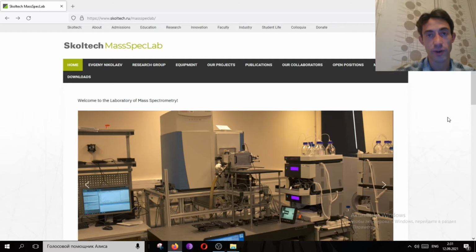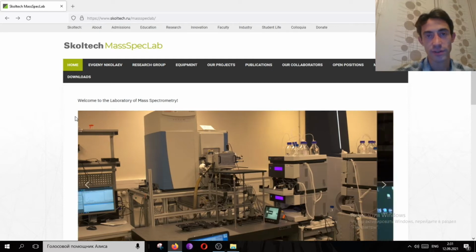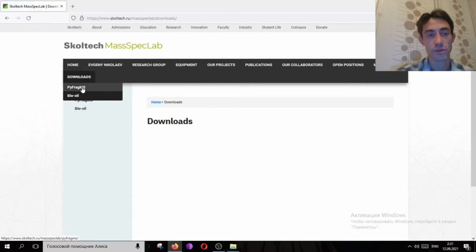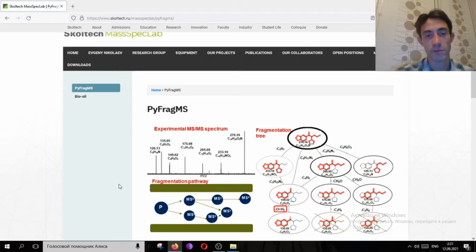First of all, how to find it. You can Google our laboratory, Skoltech Mass Spec Lab, this URL address, and here in downloads you can find PyFragMS.